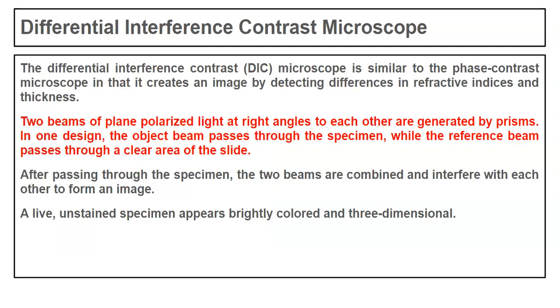Let's proceed with the principle of differential interference contrast microscope. It is very much similar to the phase contrast microscope. So it's a request to all the viewers and my dear students, if you have not yet checked the video for phase contrast, first study the phase contrast microscope in detail, and then if you come to DICM, it would be better for you to understand.